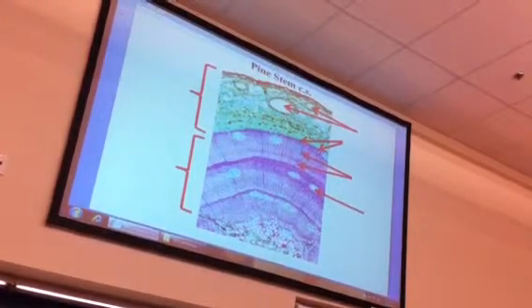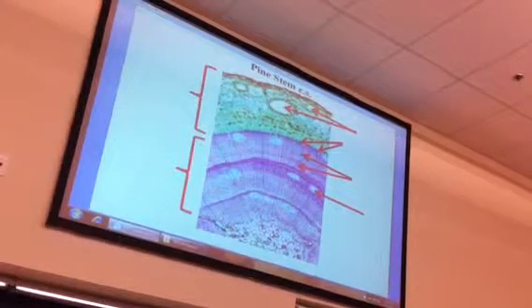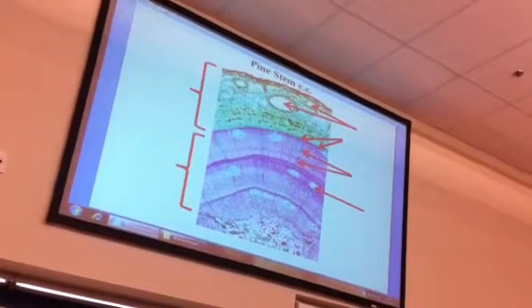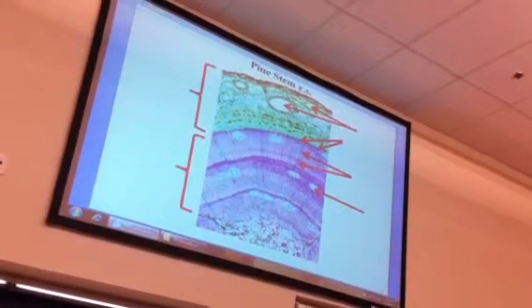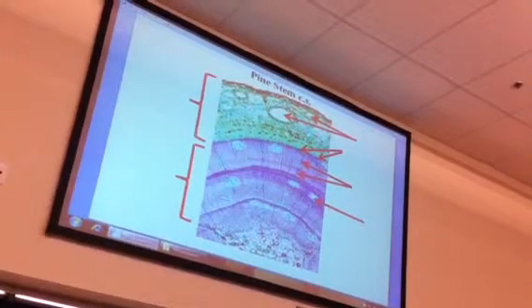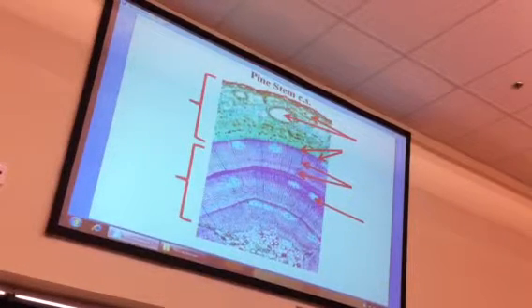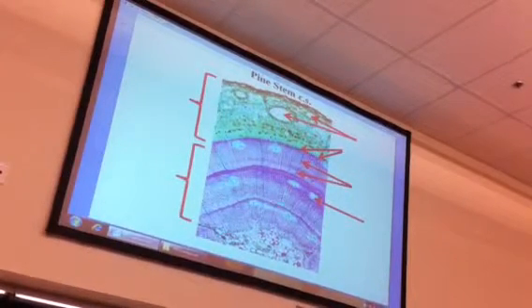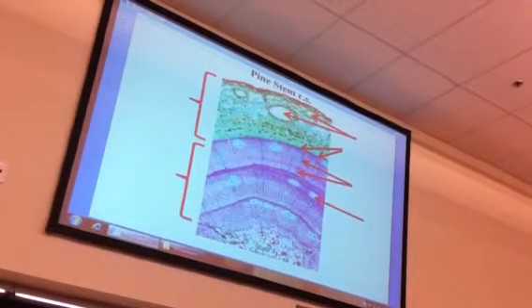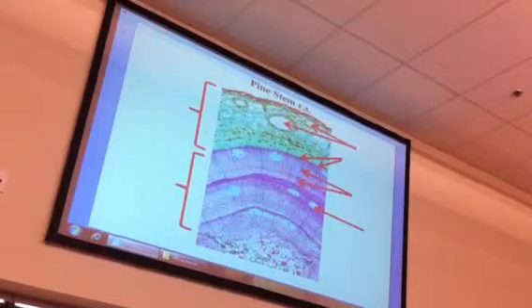The last part of this is comparisons. So let's go through the compare and contrast. I have a couple of minutes. Pine stem. Okay, we got a late start. Resin duct, bark, and then all this stuff here. I'll make sure I get through all of this. What's all this red? What tissue, or what cell type?